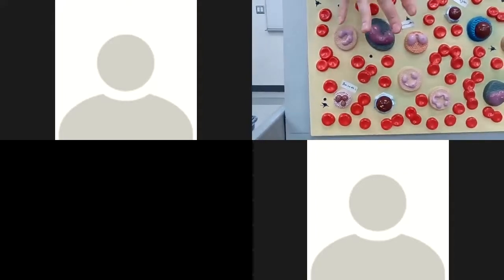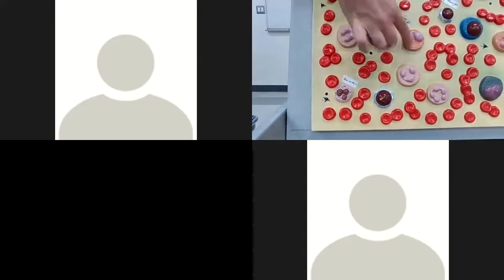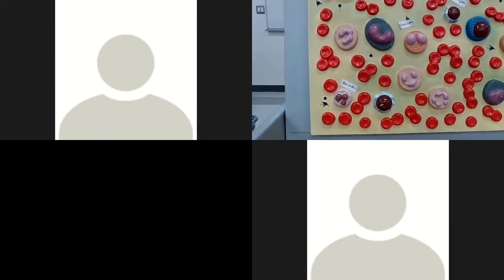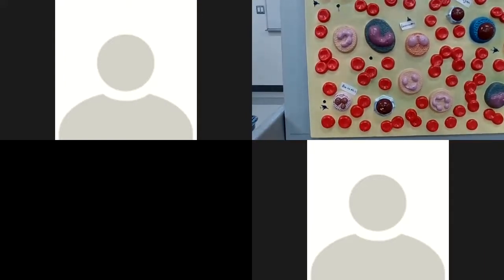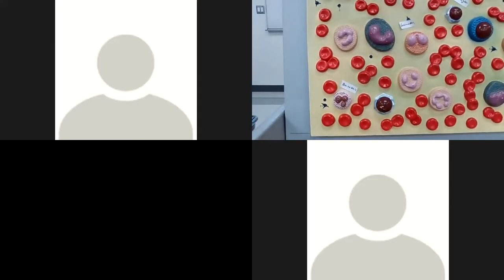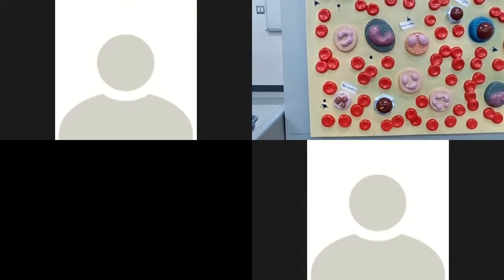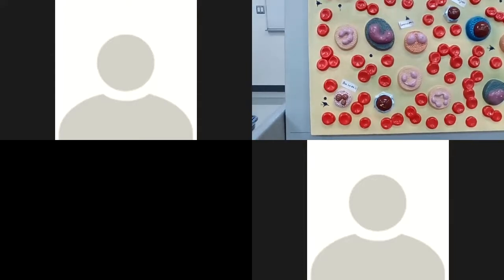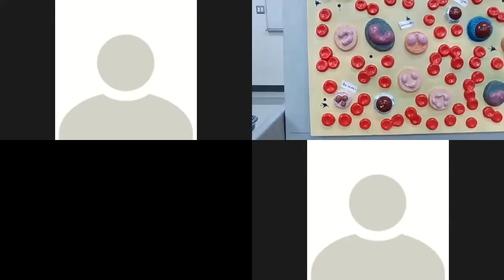But for the white blood cells, the most numerous are these that are polymorphonuclear. They have granules, and we talked about that yesterday in the lecture. Their cytoplasm stains a little bit of a lighter background, but they're rough looking because of the granules. That's all the vesicles full of chemicals. And polymorphonuclear, so they make their nucleus into these multiple bead looking things. This guy spits out its vesicles, spits on a cell first, and then tries to eat pieces and parts of it. Some of the vesicles travel and recruit more neutrophils.